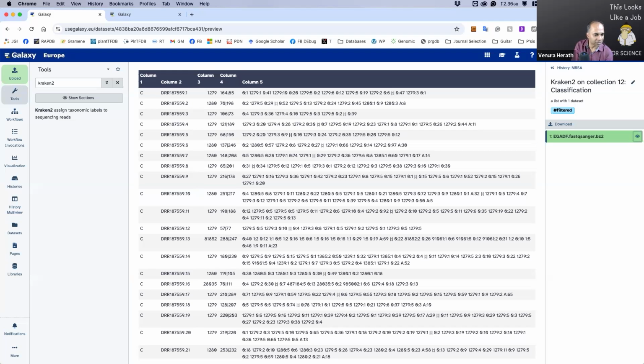Okay, so Hasnat's question is how precise the results are. It's based on sequence similarity. Remember, you did BLAST. Likewise, we have our read sequences, and we use the k-mers we learned earlier, and then we match them.